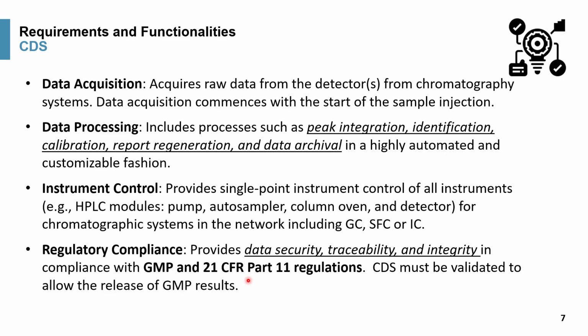This is a listing of requirement and functionality expected in the CDS. Functionality such as data acquisition, data processing through a process such as peak integration, identification, calibration through a reference standard, and report generation, and data archival. Most CDS is also capable of instrumentation control and provide a single point instrument control for all the instrument modules, including the pumps, autosampler, column oven, and detector.